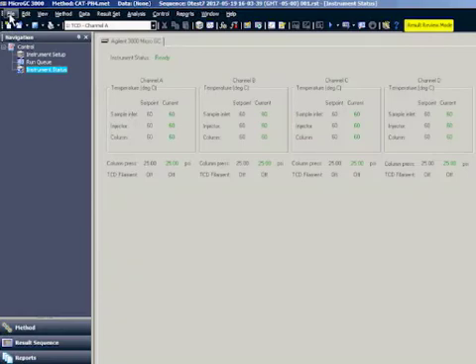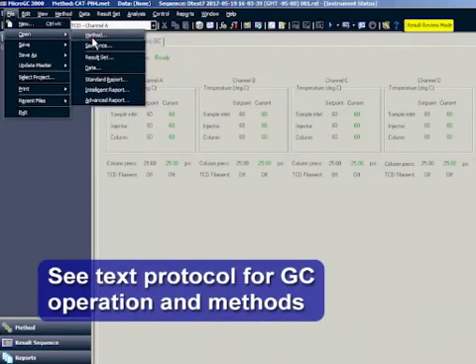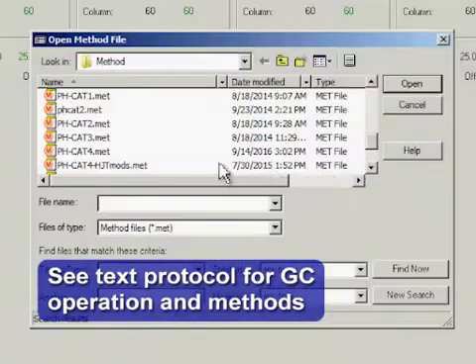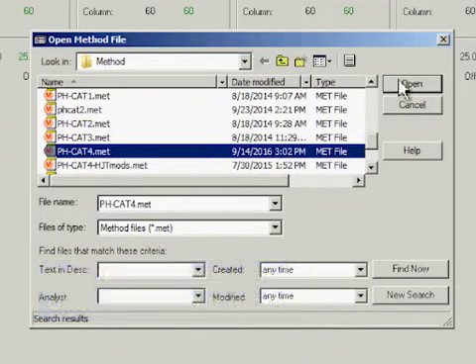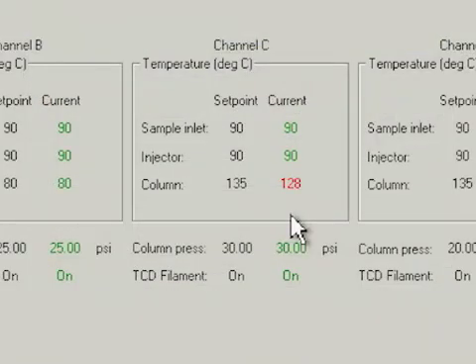Start the gas chromatograph with the valve on the sample injection port closed. Load the appropriate methods, then allow the instrumental parameters to equilibrate to their required set points.